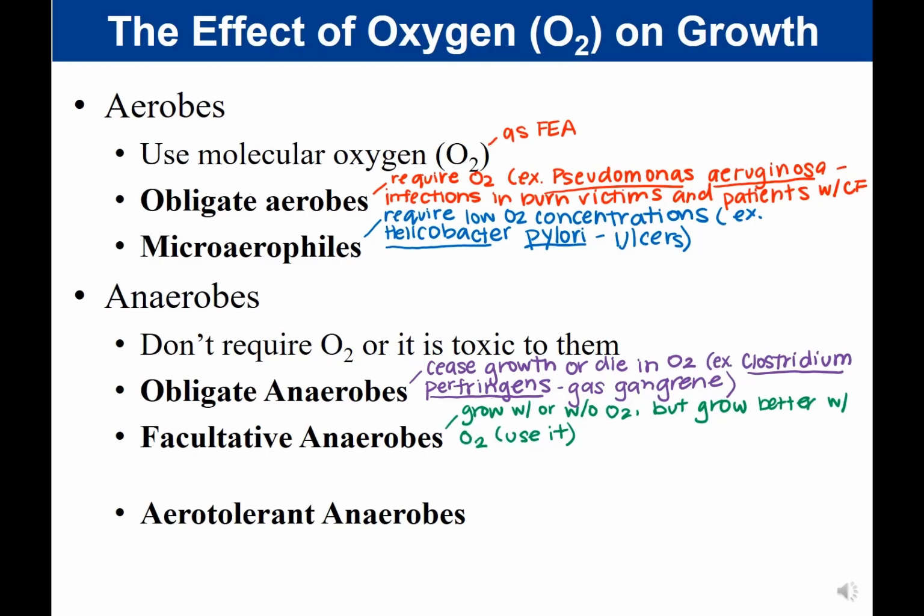And again, back then I told you that the reason for that is that if O2 is available, at the top of the agar, bacteria are going to get a lot more ATP per glucose than the bacteria growing anaerobically within the agar. And so that allowed you to see that in fact facultative anaerobes grow better with O2.